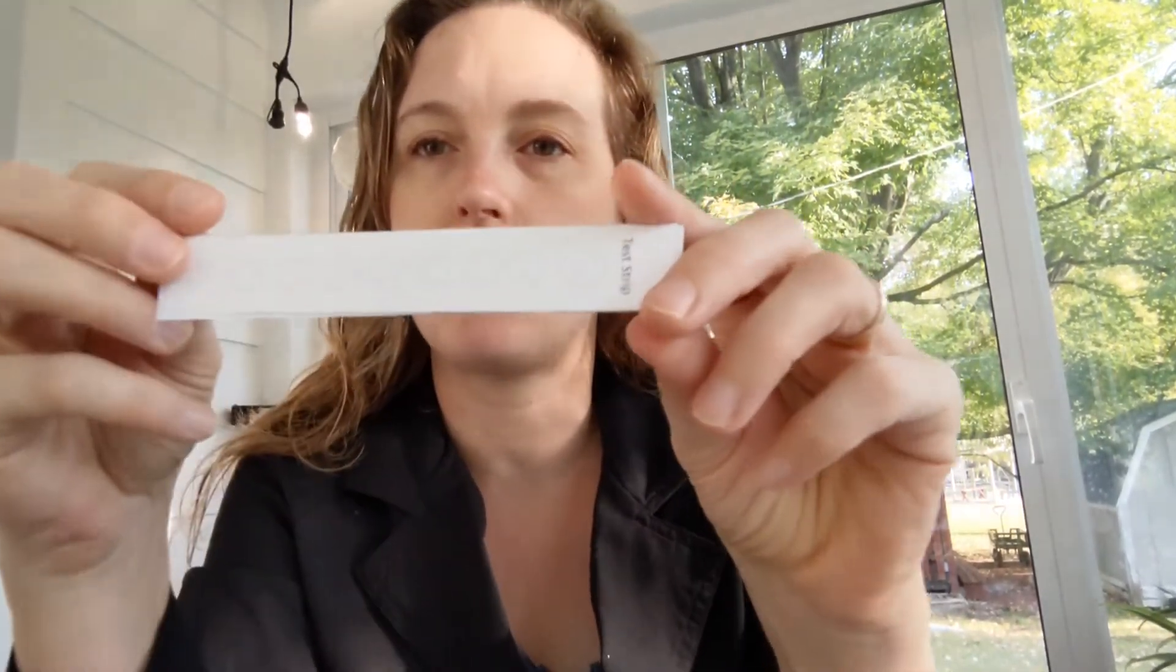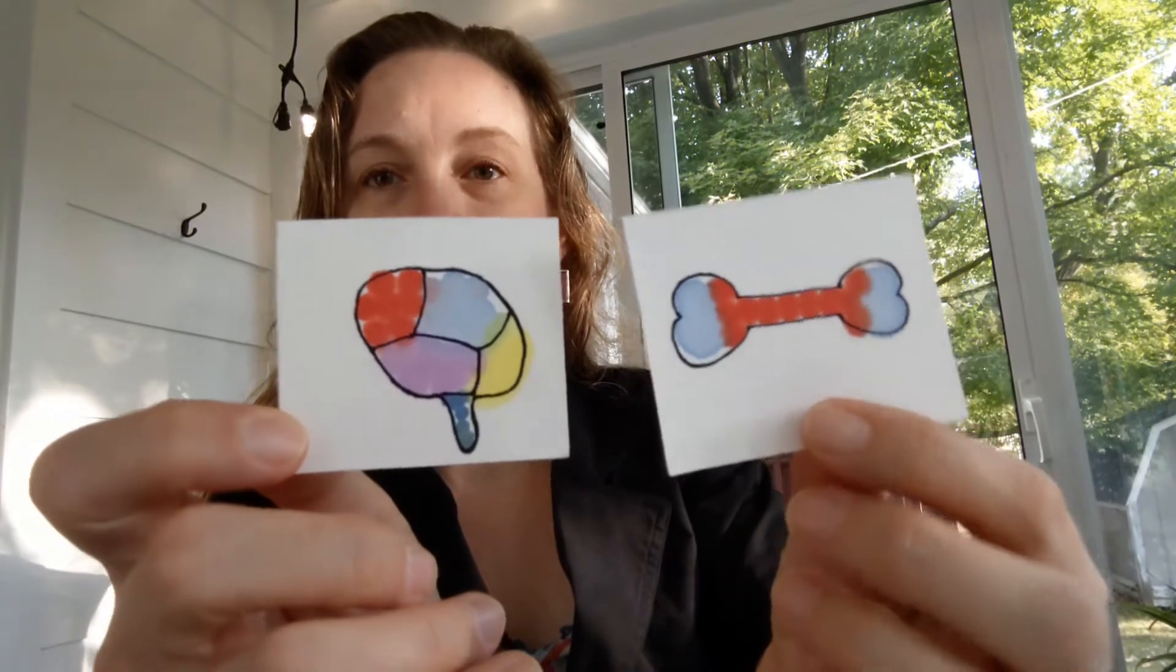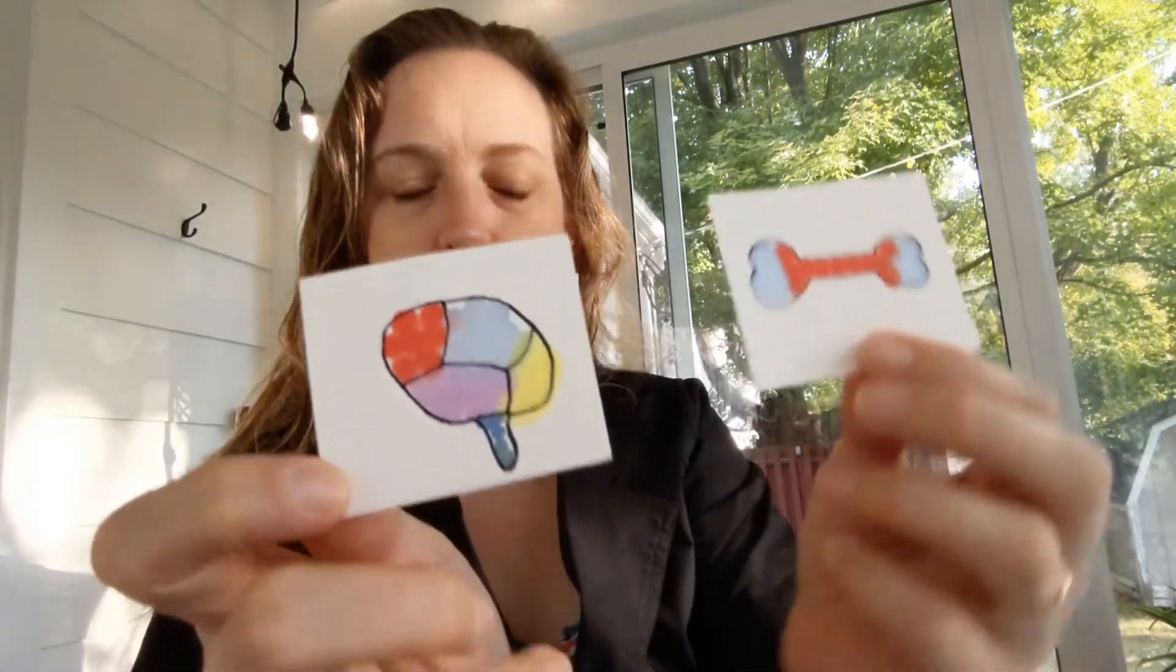Also with your kit will come 10 of these test strips. So if students don't want to go right on to their beautiful canvas, they can add droplets to the test strip to begin. There are actually 12 of these, so you have a couple backups just in case. And you're going to get 12 of these small pieces of canvas. So if students finish early, they could create their own artwork. These are my attempts. I think students might be able to do better than this.